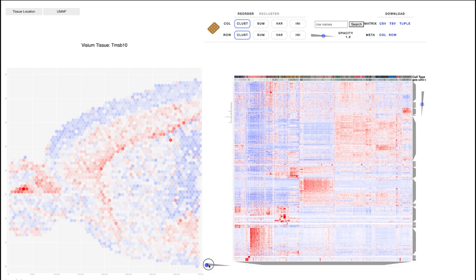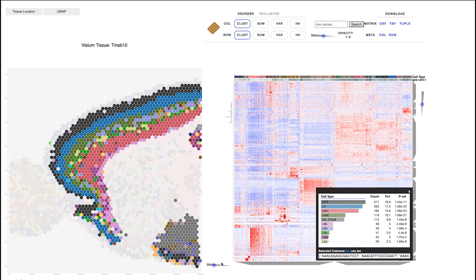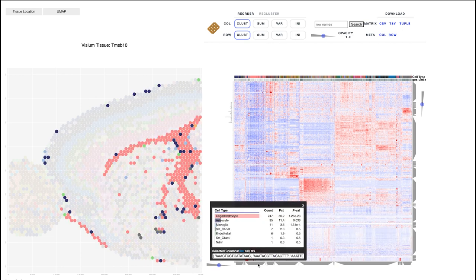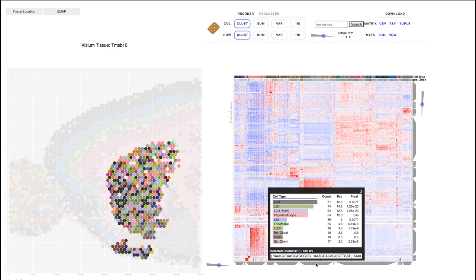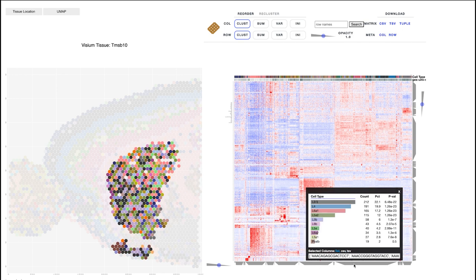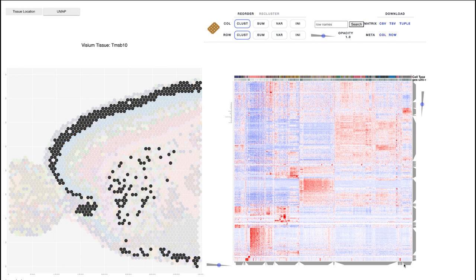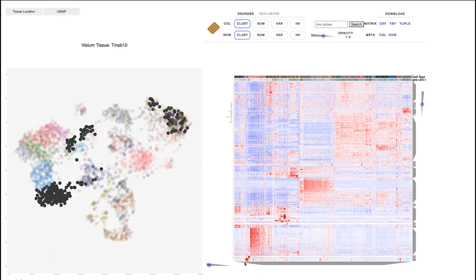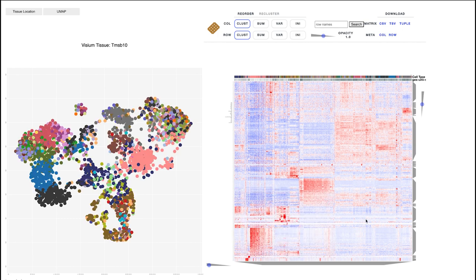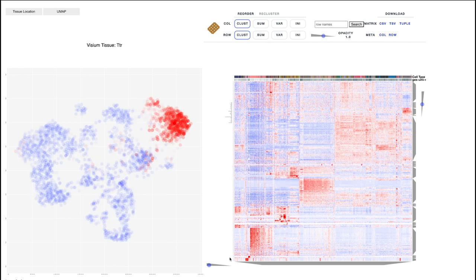You can do similar things to what we did with the CityBike example — you can go in and say show me two broad neighborhoods in this brain. If you had to break the brain into two parts, you could break it into these two regions, but of course you could go with a lot more granularity and find different spot regions. What's cool is that these spots are phenotypically similar based on expression of different genes, and they just so happen to be located in the same physical space — showing a lot of concordance between gene expression and physical location. Once again, we can transfer these data points to a UMAP, and you can even click on a row and see that in the dimensionally reduced space.